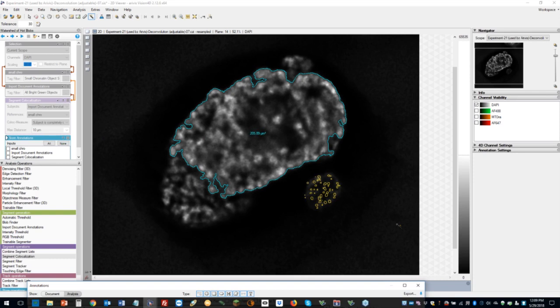I would say that the pipelines I had to build were a little bit complicated because the cells were reaching out and touching each other very frequently. It's like spaghetti noodles, all intertwined, and that makes things a little bit more challenging. But I was pretty happy with the results. So I would say yes, we can work with DIC images, and I'd be happy to sit with you and look at some of the motifs.